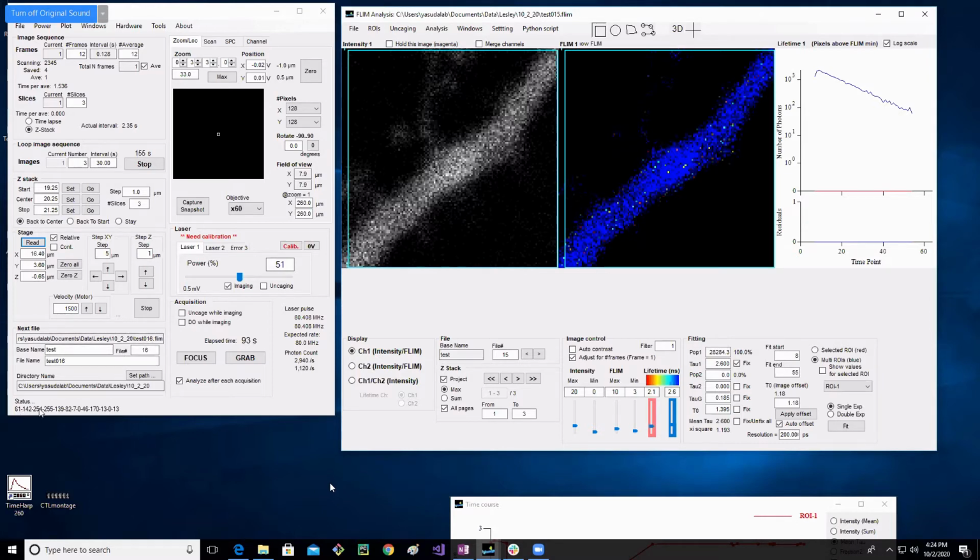I assume you guys have been told about how the file naming works and setting your path, correct? And the importance of saving your sanity by always starting your experiment with a new base name and at number 1. It really makes a difference. If you can at all get used to doing that, it'll make your life easier when you analyze data. Okay, so now that we have that, basically, let's talk about some of the more interesting things, okay?